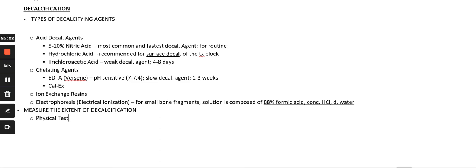You know, kanang toothpick, di ba? Itusok-tusok lang, pero maupod lagi na. It's not reliable at all. Okay? It is inaccurate, and small calcified areas, those very tiny particles, will not be detected if ever. Now another one is your chemical method. Your chemical test is in the form of your calcium oxalate test.